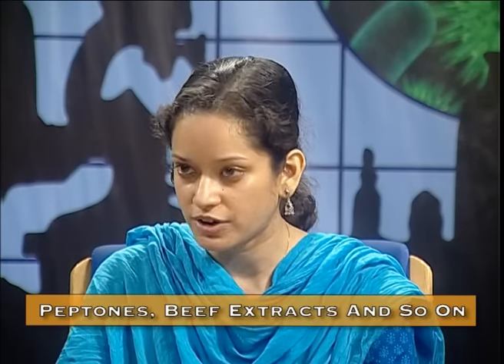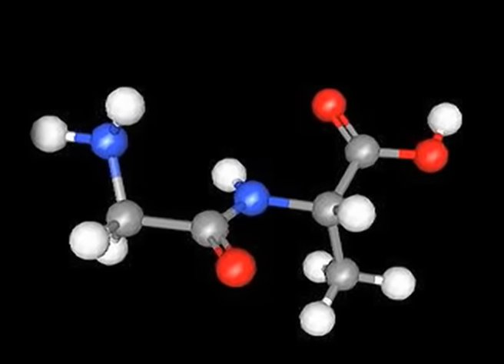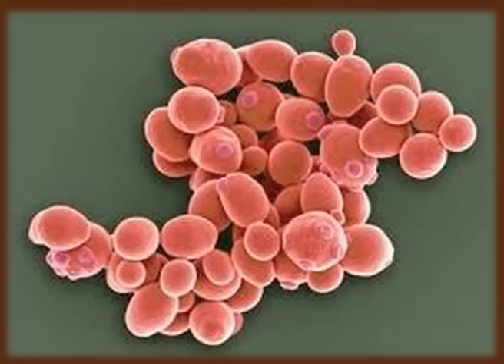Mostly the complex medium contains peptone, beef extract and other things. Peptones are derived from the incomplete proteolytic digestion of casein, soya meal and other proteins. Ma'am, what is the function of yeast extract in medium? Yeast extract is derived from brewer's yeast and it is a rich source of vitamin B, carbohydrates and proteins in the medium. The microbes growing in medium containing yeast extract are able to degrade it and produce their necessary macromolecules.